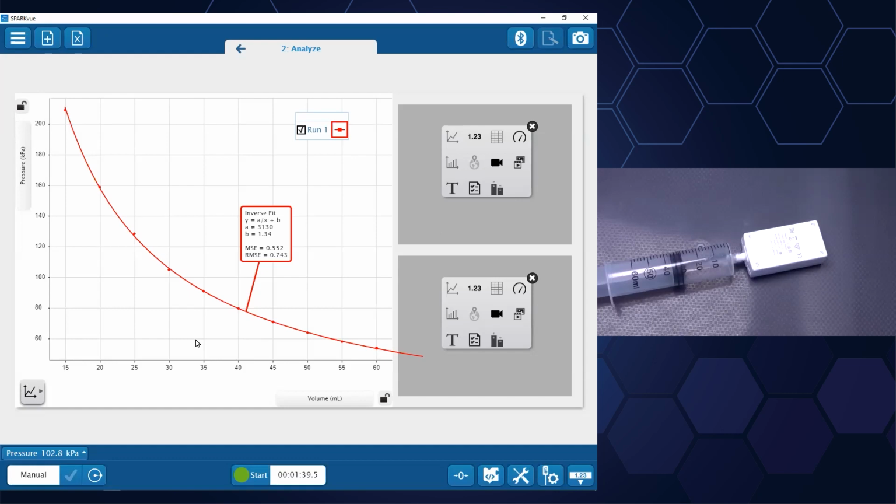Well, that's the experience I want my students to have. So how can I encourage that? Well, I'm going to go ahead and turn off, I'll leave the curve fit there for a moment to remind myself. I'm going to come over here to this tile that's in the upper right, and I have a placeholder. I can put something small here.